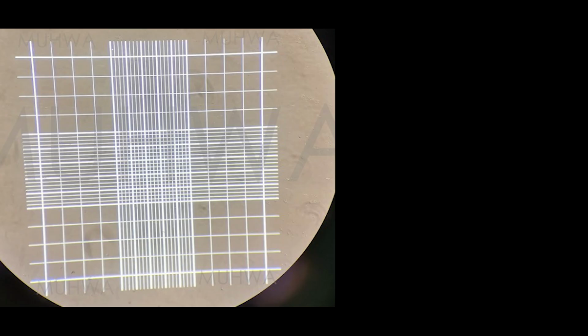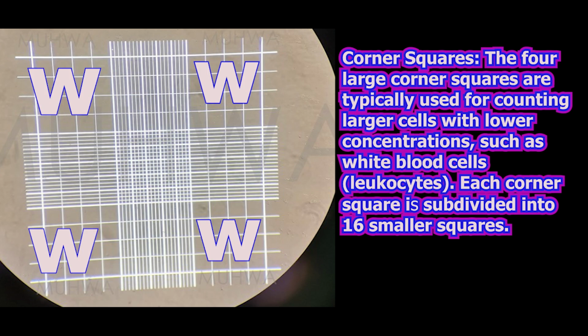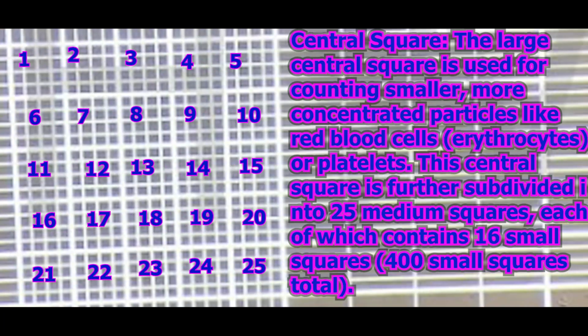Let's calculate from the Neubauer counting chamber. The counting chamber has 9 large squares, each measuring 1 millimeter by 1 millimeter. But the 4 corner areas are subdivided into 16 small squares for counting WBCs. The center square is divided into 25 squares, and these 25 small squares are again divided into 16 very small squares. These are used for RBC count.